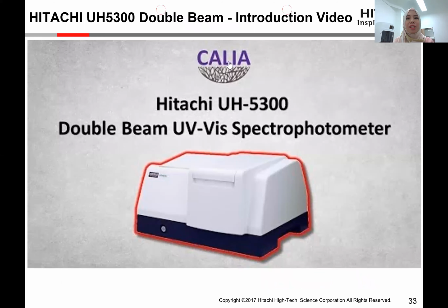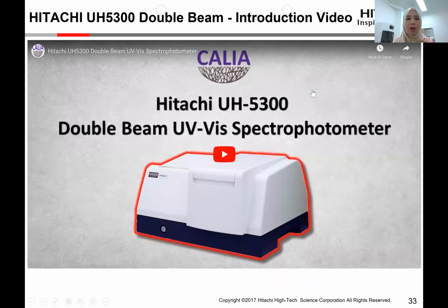Okay, without further ado, let's have a look at the Hitachi introduction and also the software function.